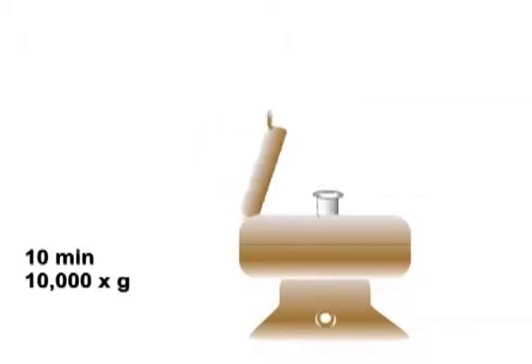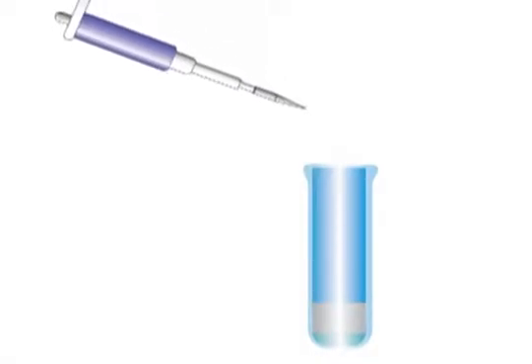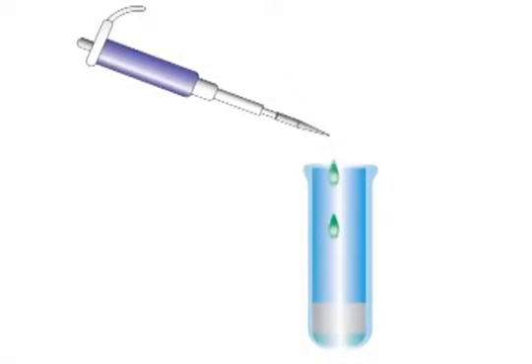Centrifuge the sample for 10 minutes at 10,000 Gs. Remove the supernatant, which contains the acid-soluble FITC-labeled fragments. Transfer the supernatant to a cuvette or multiple well plate, dilute with assay buffer, and read the sample on a fluorimeter.